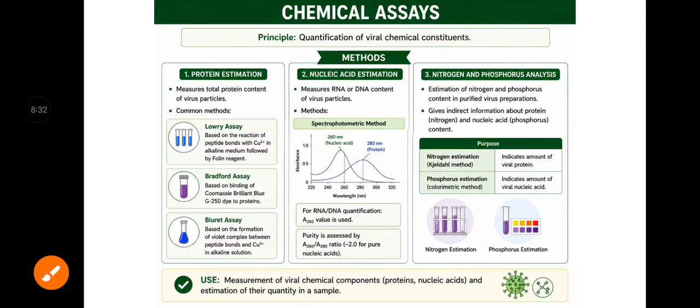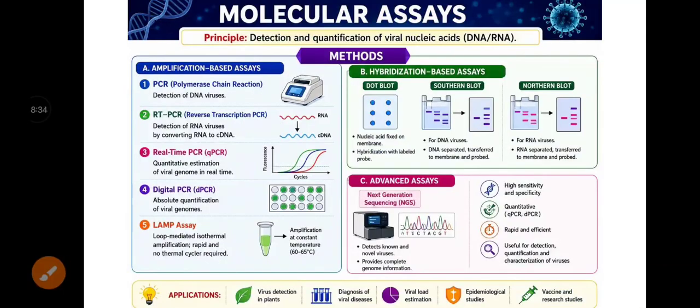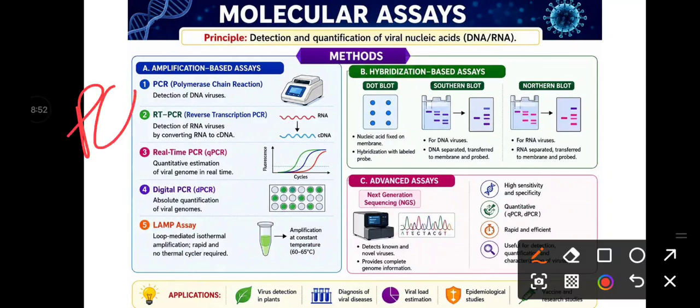Okay, next, about the final assay, the molecular assay. Molecular assay means we will detect the molecules, that is the nucleic acid, DNA or RNA, using advanced techniques. The advanced techniques may be either PCR based, or hybridization based.